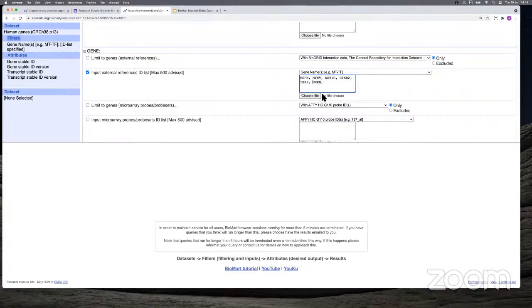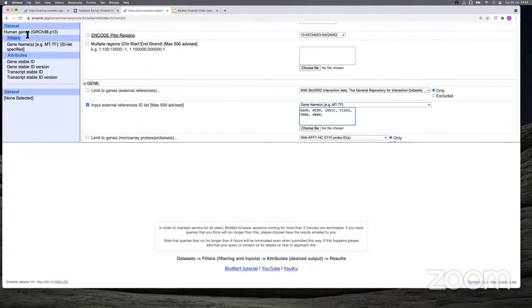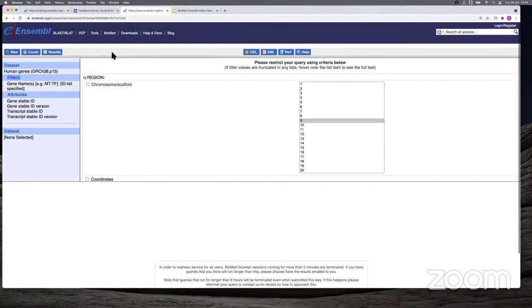And then you can also, if you want, choose a file from your computer as your input data. And in this text box, your items could be comma separated, or they could also be in a list. So now we've specified our filters, and this also becomes available, as I mentioned before, on the left-hand side under the filters section. So just to make sure that our filter has indeed applied, I'm also going to click on this count function.